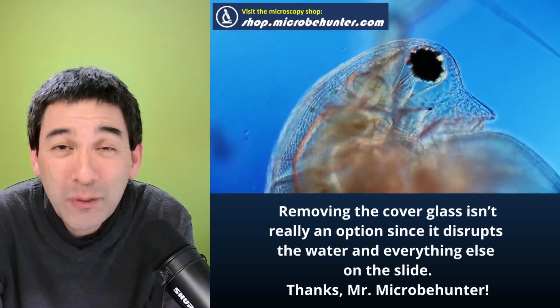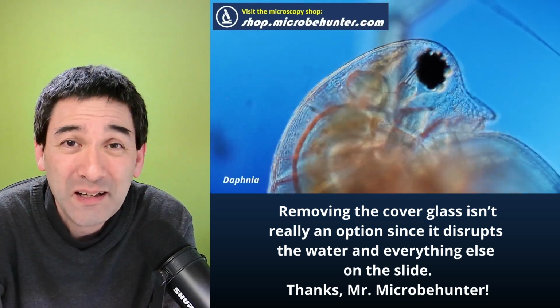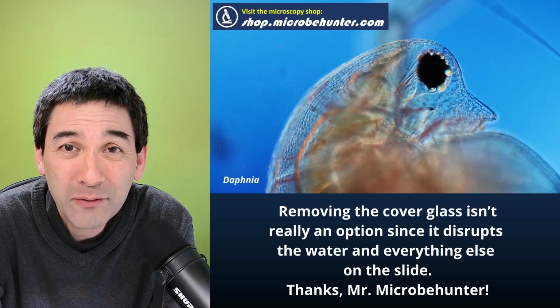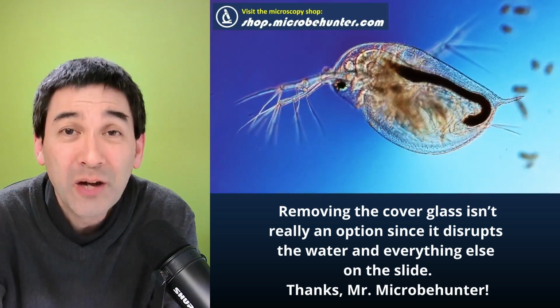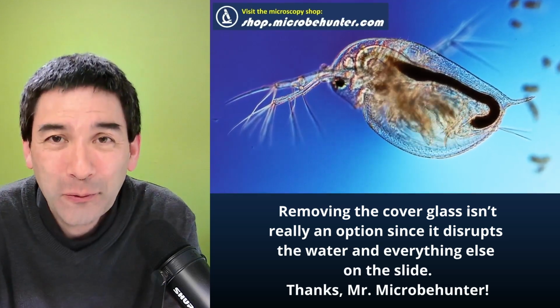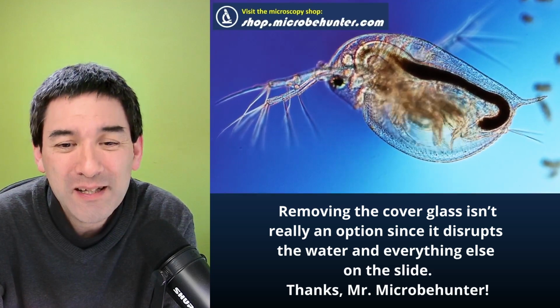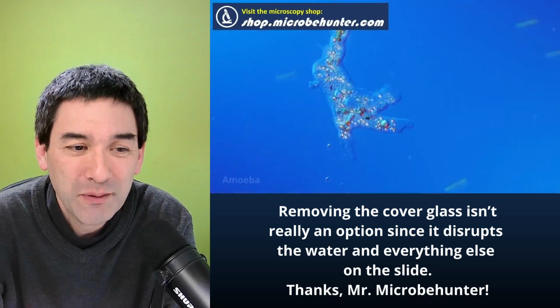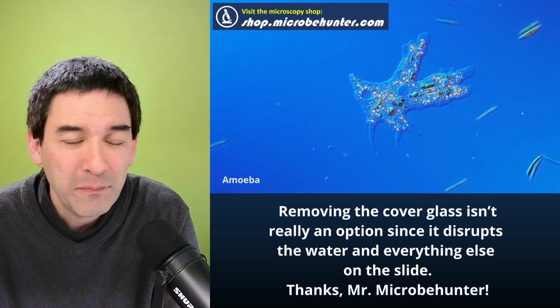And I keep on doing that, and every time I transfer the tardigrade from droplet to droplet, the number of contaminating cells and other debris goes down as well, until the tardigrade is basically all alone on the microscope slide without anything else. And this is usually how I'm getting my nice videos and pictures. Okay, so this is simply something that I would like to share with you.